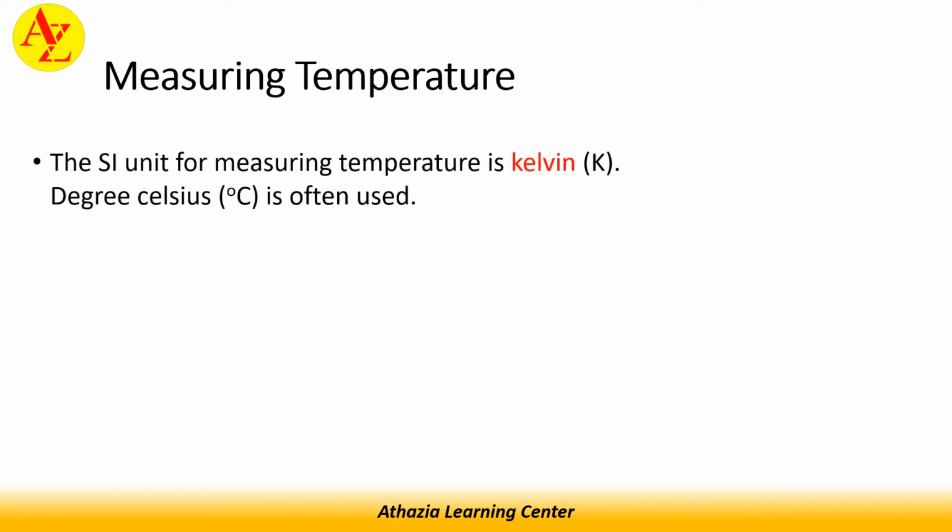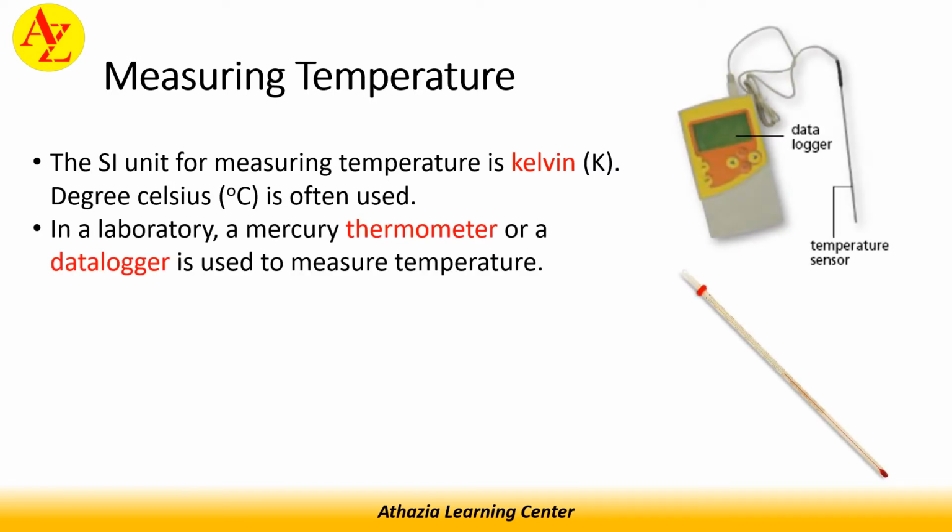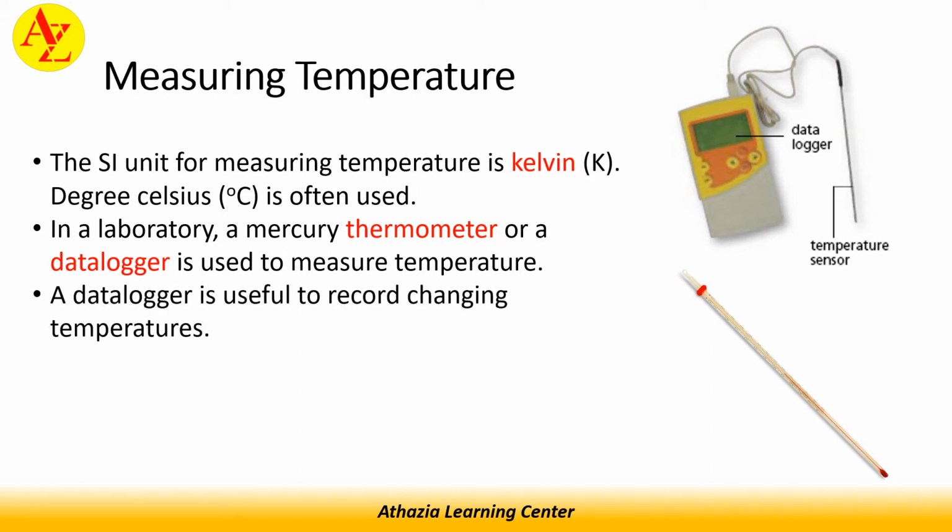The SI unit for measuring temperature is Kelvin, but often degree Celsius is used. In the laboratory, a mercury thermometer or alcohol thermometer is used, or even a data logger is used to measure the temperature. A data logger is useful for recording changing temperature.